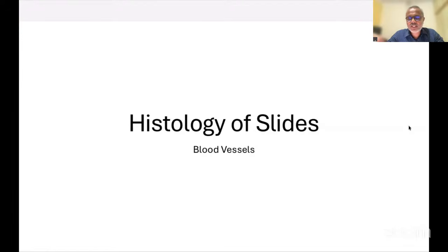We are back with three more important slides which belong to general histology, and we'll be talking about the histology of blood vessels today. And in histology of blood vessels, we get three major slides for discussion, and let's try to dissect each slide one by one.